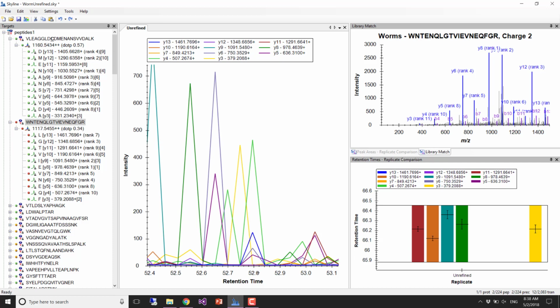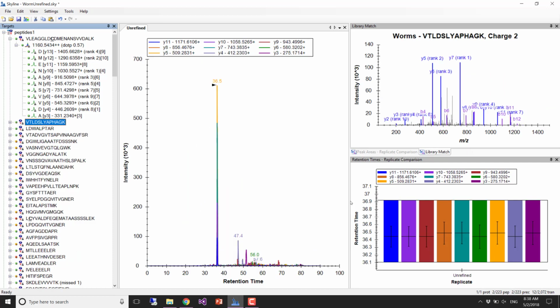No, yeah, so I don't know. There's a moment where a bunch of things coelute but they only go up to 100. So, yeah, I think you have to say we just couldn't detect this. As you've heard, you might be able to detect it if you did the right sample prep, but this is just a very simple sample prep with a worm lysate that we're looking at.